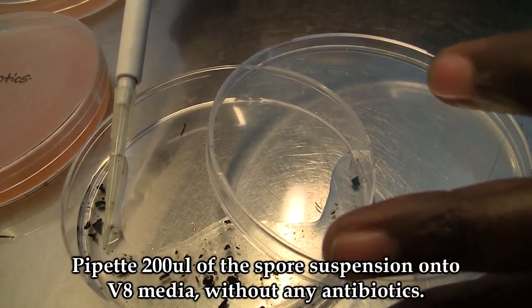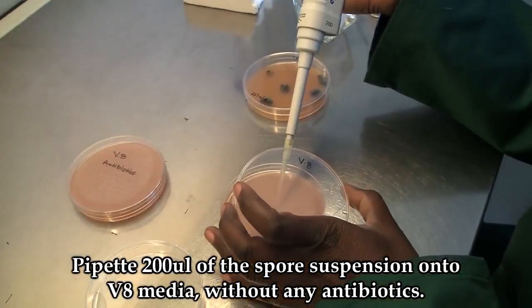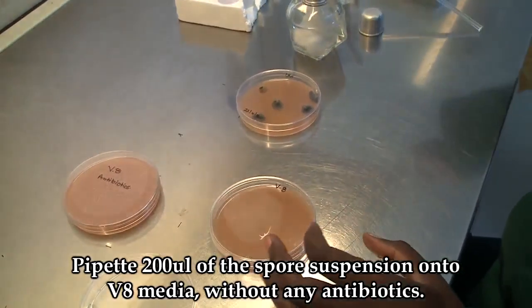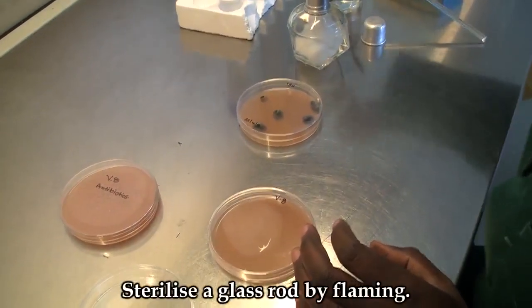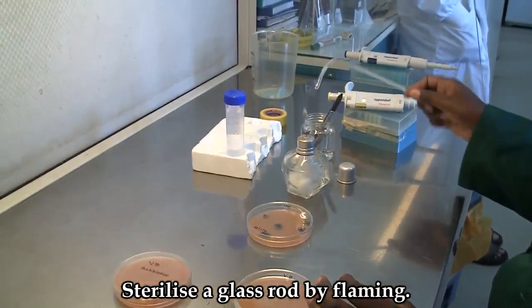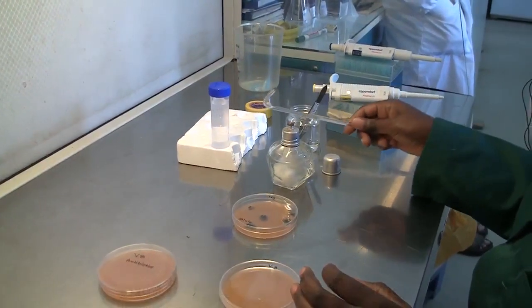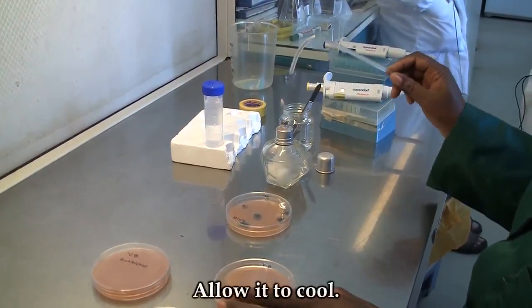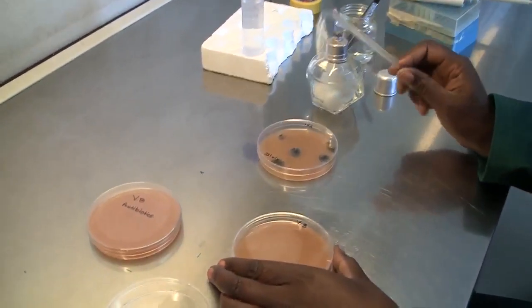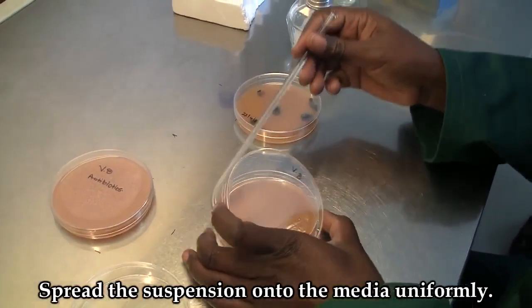Pipette 200 microlitres of the spore suspension onto two V8 media plates without any antibiotics. Sterilize the glass rod by flaming, allow it to cool, and spread the suspension on the media uniformly.